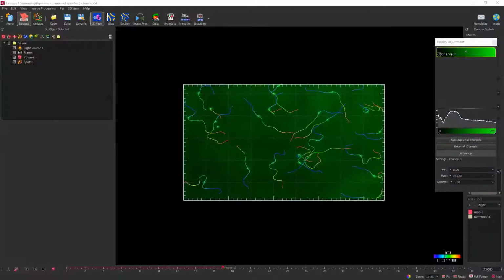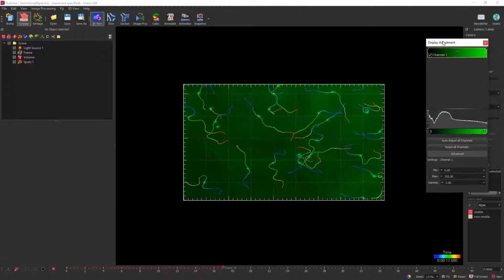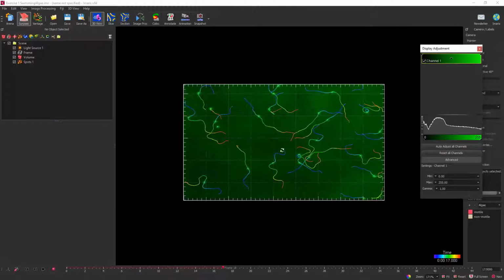So the first ones came in from Magdalena and Orly, asking about the reference frame, and asking if you can pick a point that you can measure directionality in reference to. So definitely, that is definitely possible.